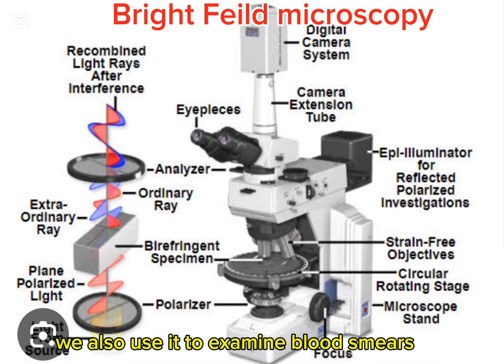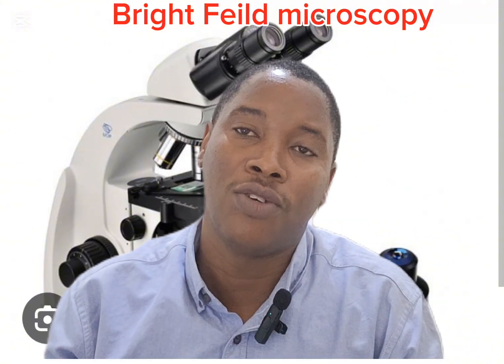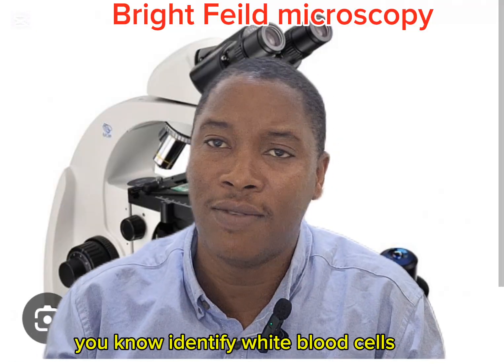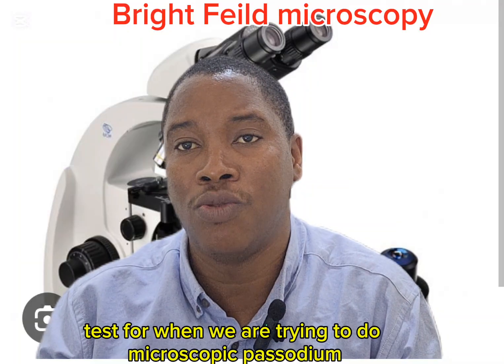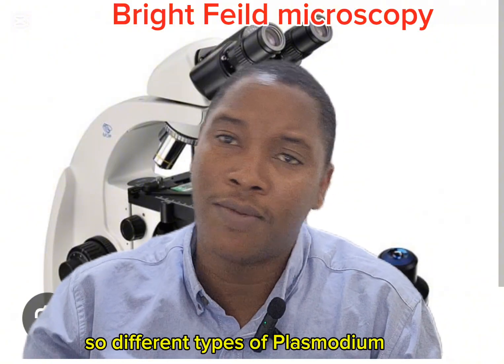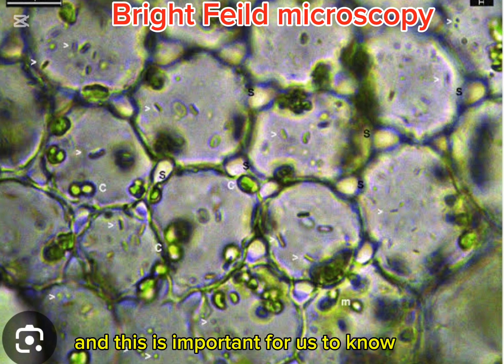Now, apart from that, we also use it to examine blood smears. You take samples of blood and make a smear. You stain many times, using either Wright stain or Giemsa stain. If you stain these blood samples, you can view them in the microscope. It's very good for identifying white blood cells, red blood cells, and the presence of particular parasites. Especially the simplest one we do, especially in Africa, is microscopy for plasmodium, because we deal with malaria a lot. Different types of plasmodium, vivax, ovale, malariae, we can see a lot in those blood samples.